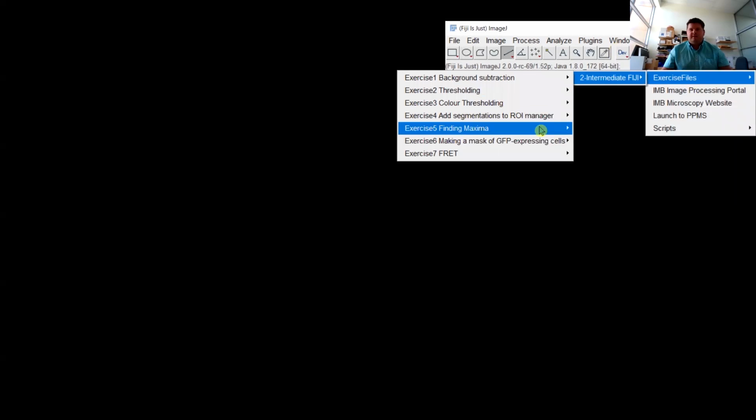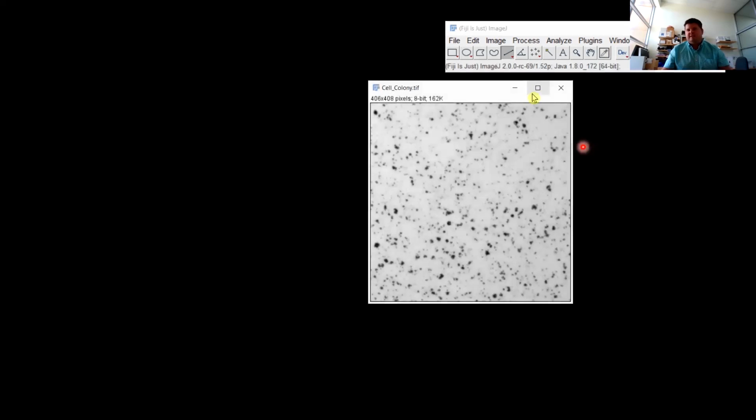All right. I'll just quickly show the light version, which is just inverted. You get that extra option.